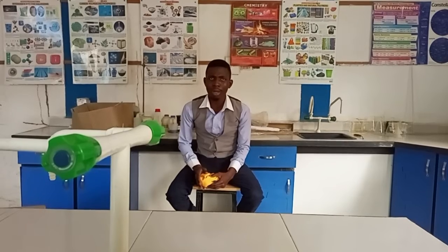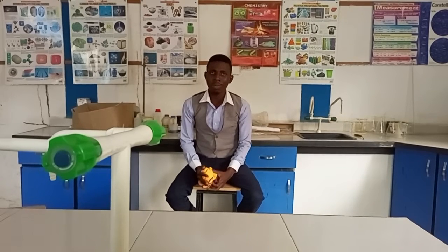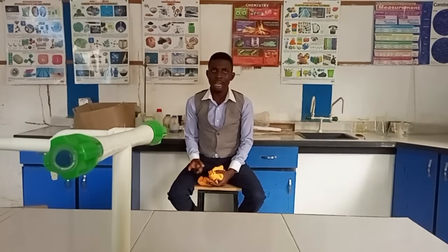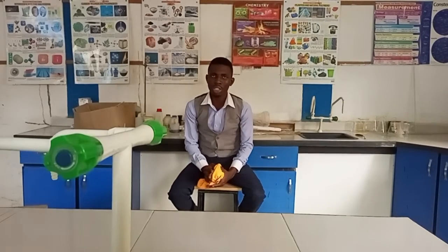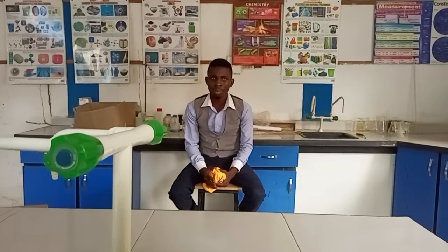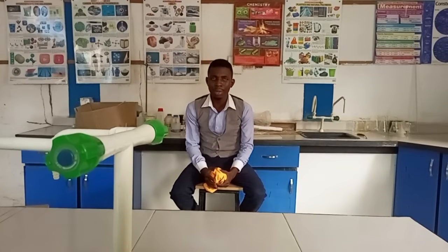Now, the chemistry practical for your GCE is divided into three sections. We have the titration experiment, we have the salt analysis, and the third aspect happens to be your general knowledge about chemistry.